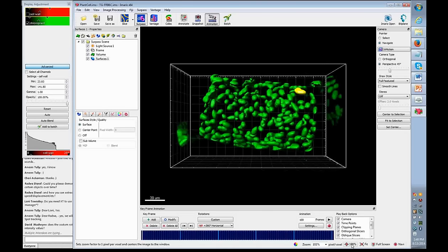Here, they're large enough that there's not a huge amount of elongation due to optics, but this data set has been downsampled a bit, and so you do have some elongation just from undersampling. It's going to be a problem in general with the segmentation, so your results in Imaris are generally going to depend on how good your image acquisition is, somewhat not surprisingly.